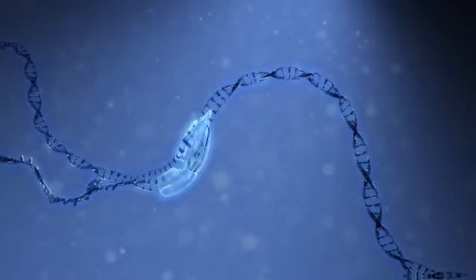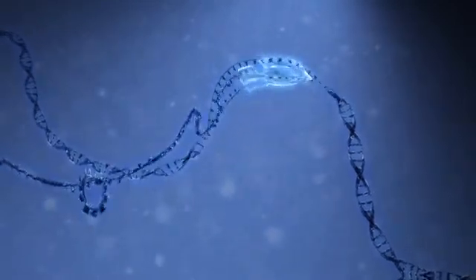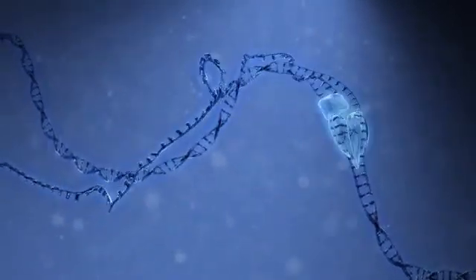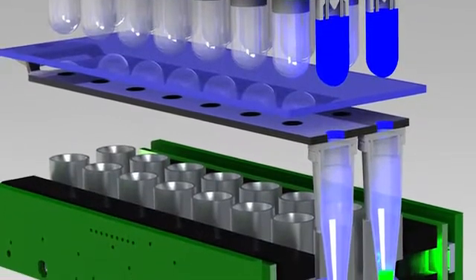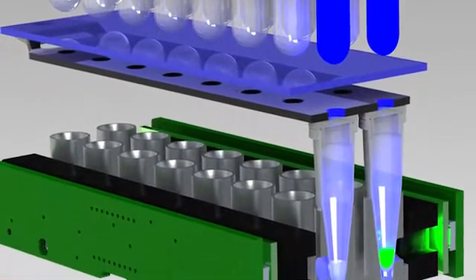It precisely heats and cools the sample, and if the particular DNA sequence of interest is present, it gets copied during each heating and cooling cycle. You can imagine in this exponential growth process, 1, 2, 3, 4 molecules, we can't really see the difference yet. But as soon as the exponential curve takes off, we can see them. We shine blue light at the sample, and if DNA is present, another molecule within the sample converts this blue light to green light. The green light then passes through an optical filter and hits a photodetector, allowing us to measure the amount of DNA present.